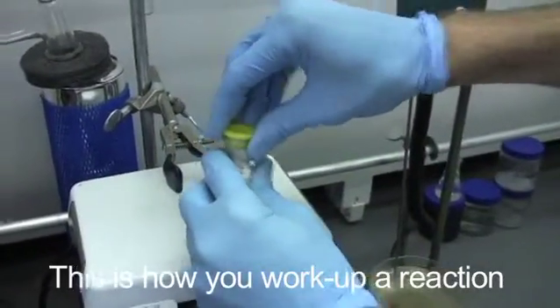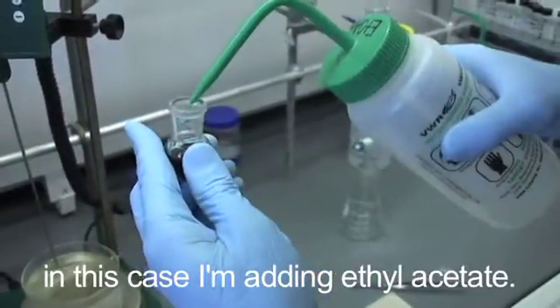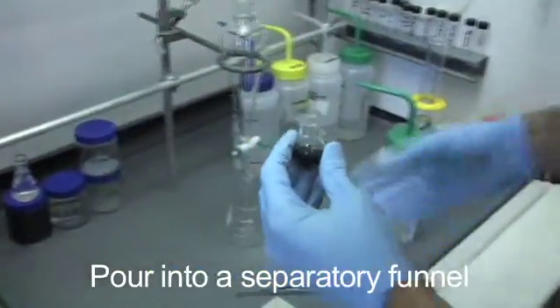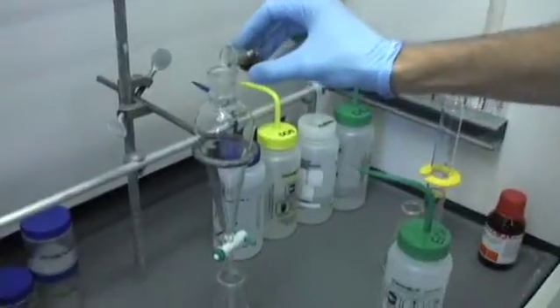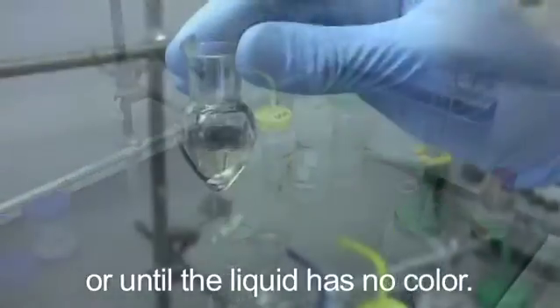This is how you work up a reaction. Add some of the organic solvent, in this case I'm adding ethyl acetate. Pour into a separatory funnel. Rinse the flask a couple of times, or until the liquid has no color.